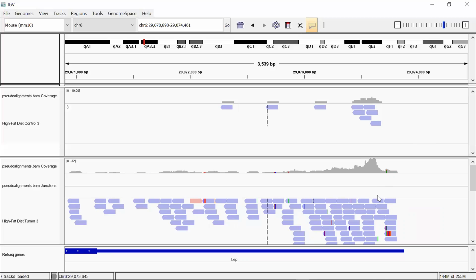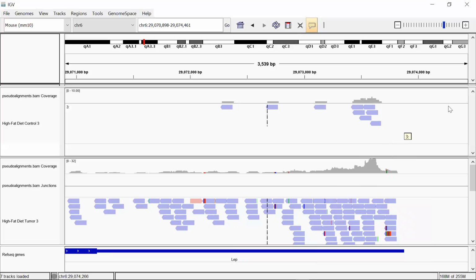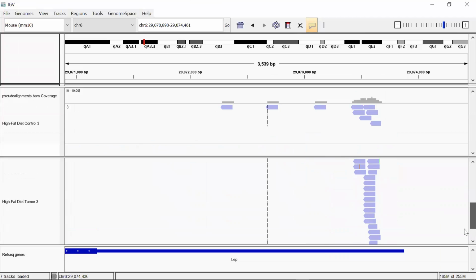Each of the reads there is a random sequence of mRNA from a pool in the samples. And so it is representative of there just being more mRNAs and more of that transcript type expressed in the cell. So up in the top there, this is essentially like our controls, where you expect it to be more empty. And the bottom one is a lot more full of reads.